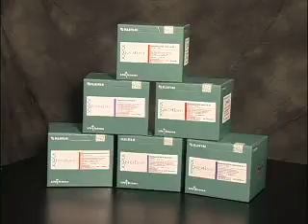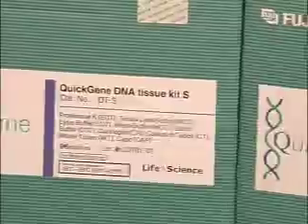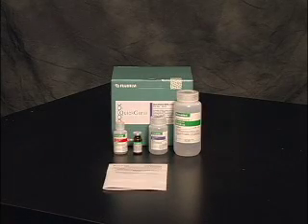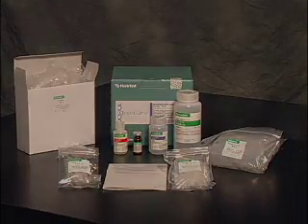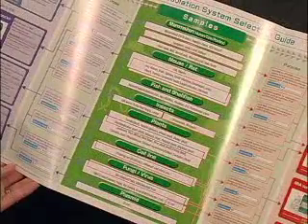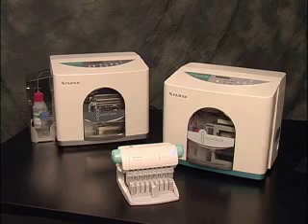Nucleic acids from a variety of starting materials, including blood, animal tissue, cultured cells, plants, and microbes can be easily extracted using the Quick Gene systems. Quick Gene Reagent kits contain everything needed for sample processing, including the appropriate enzymes, buffers, cartridges, caps, and tubes. The Fujifilm selection guide can help determine which kit to use, based on sample type and species origin, whether the experiment calls for DNA or RNA isolation, and what application the sample will be used for, from expression analysis to genotyping to PCR applications.